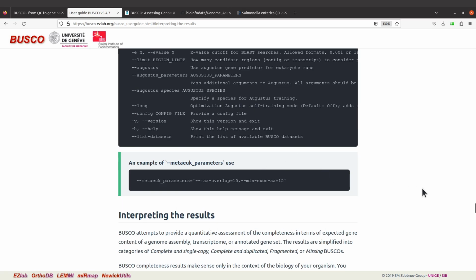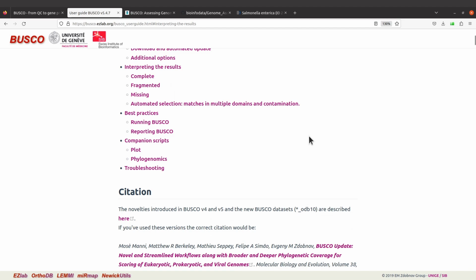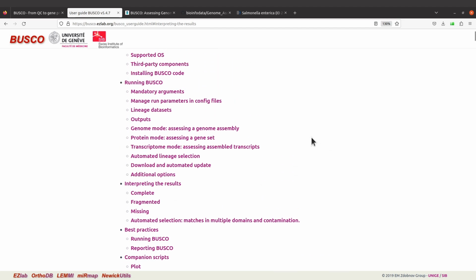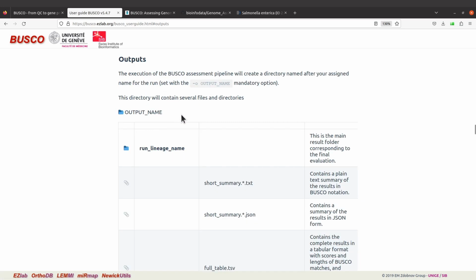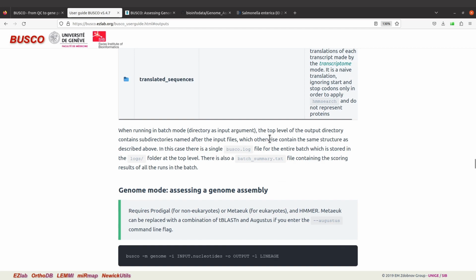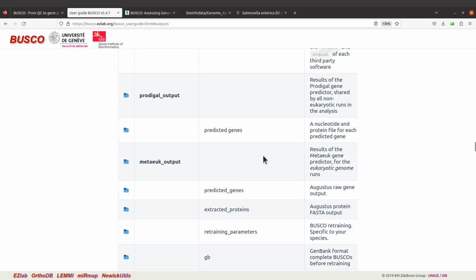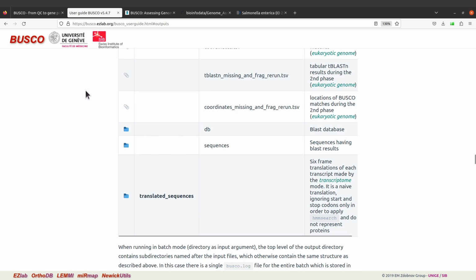On the user guide page, let's just check. There's a section for it. Let's see. Yeah, we have the output here. So click the output, and then you have a description of the files here. A detailed description is beyond the scope of this tutorial, but I will encourage you to read that here. You can also use your file manager. Let's open the files.